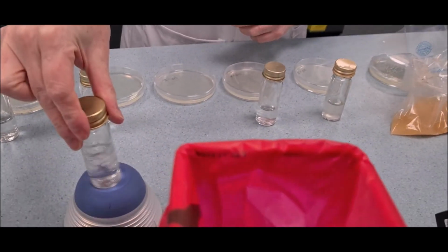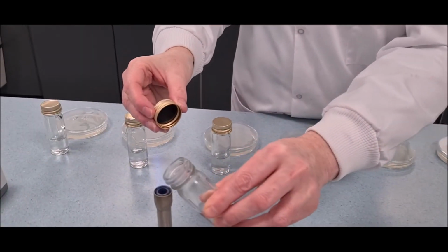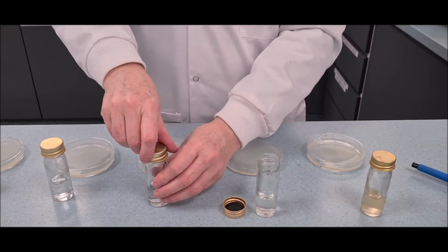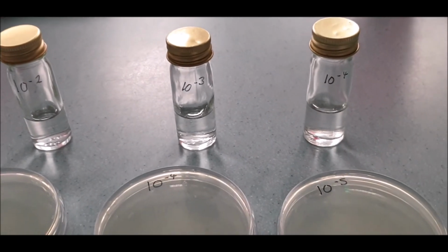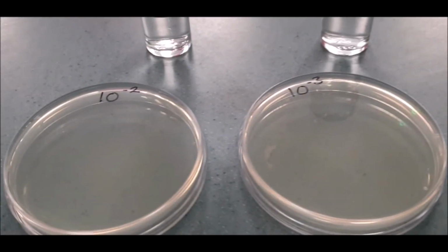Remember to always flame the neck of the bottle after mixing and opening the cap. Always use a fresh pipette tip to transfer the sample. The highest dilution in this demonstration is 10^-7. The respective dilutions are now ready to be plated onto selective and differential media.